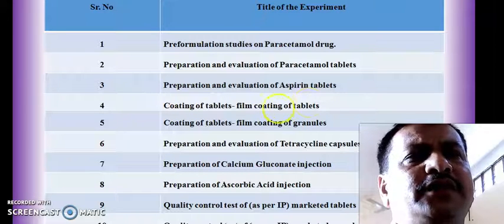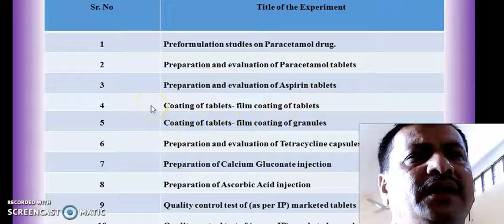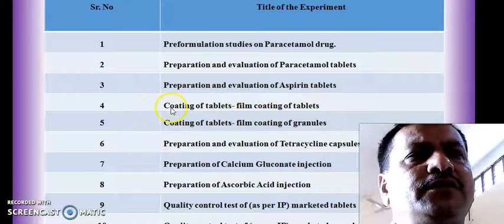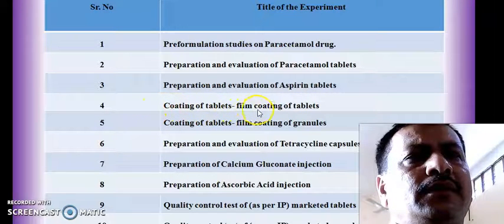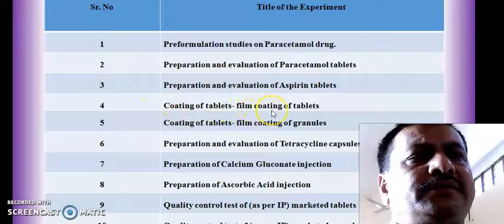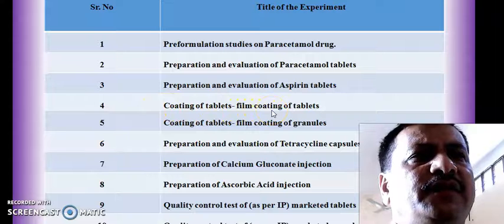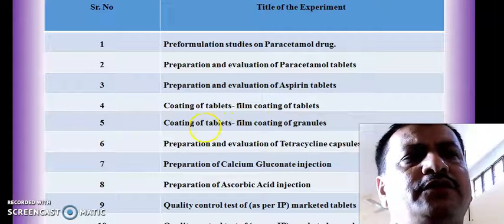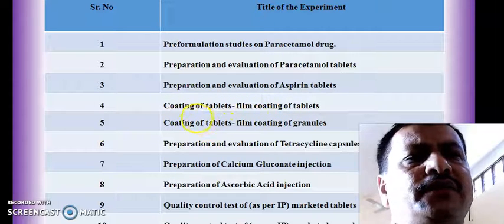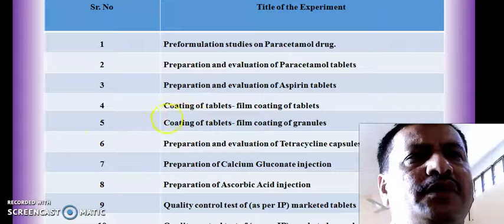The fourth experiment is regarding paracetamol tablets, in which we are going to prepare paracetamol tablets with the help of film coating by using suitable film coating polymers.